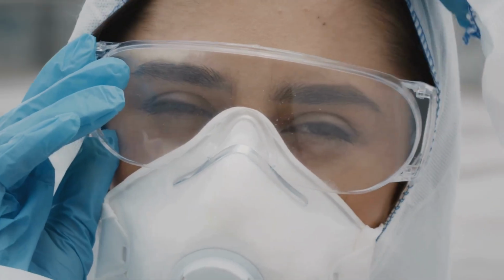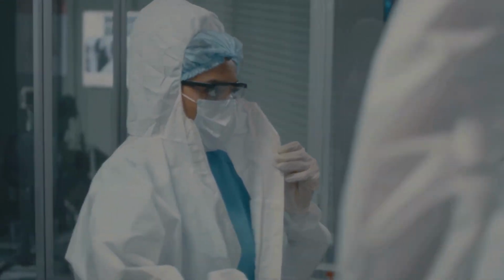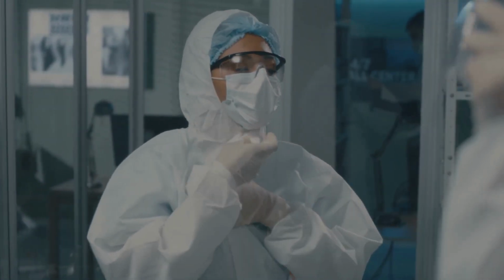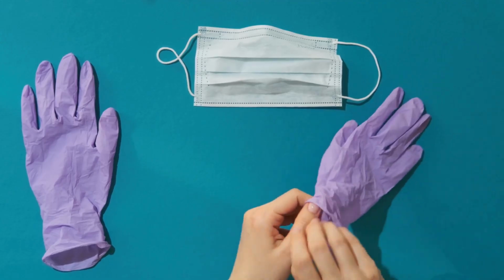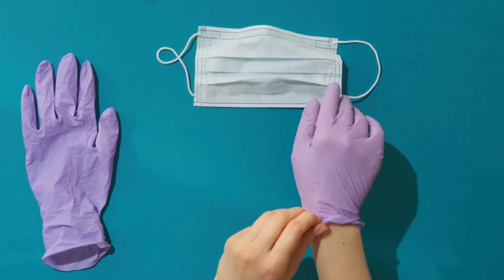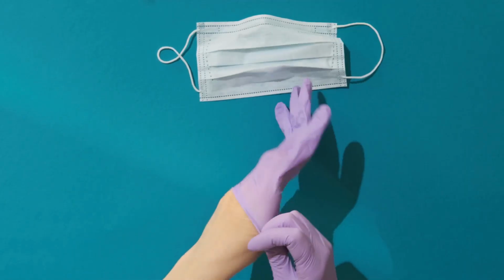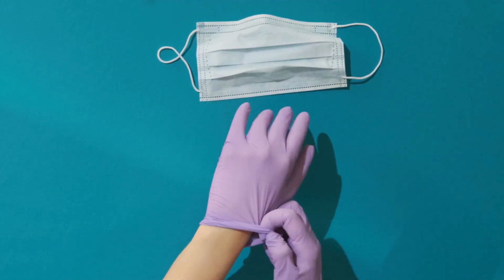Removing PPE, doffing. Removing PPE is often the most hazardous part of the process because the outer surfaces may be contaminated. Gloves must be removed first. Pinch the outside of one glove at the wrist, peel it off, and hold it in your gloved hand. Slide your ungloved finger under the wrist of the remaining glove to peel it off without touching the outside surface.